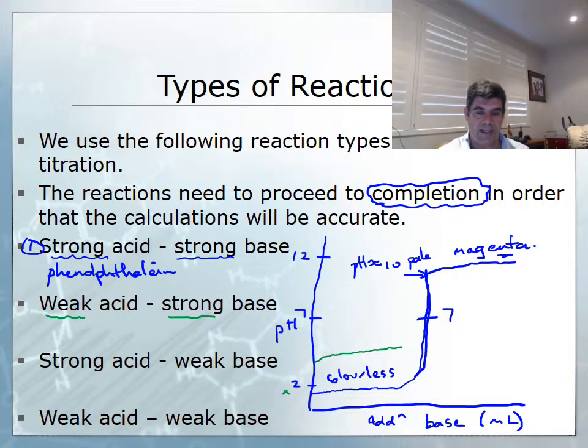As it's reacting, we are forming more and more of the ions in solution. Those ions are going to be reacting with our hydroxide ions, and so we're going to get a little bit of an upward curve down the bottom here as we use up all of those ions.